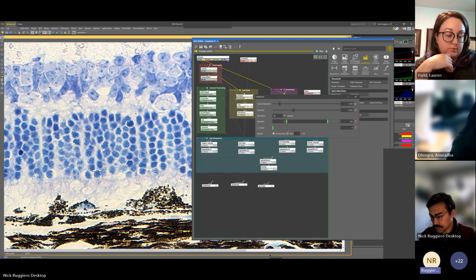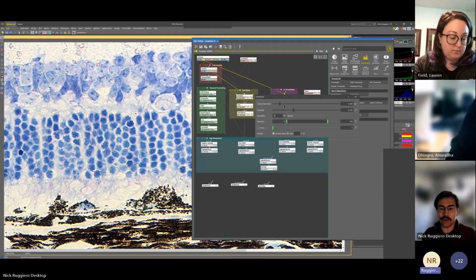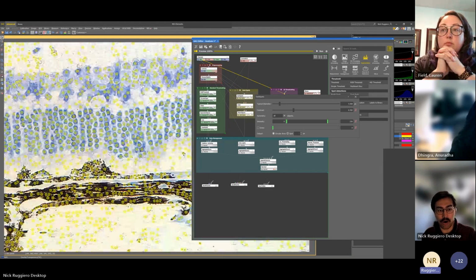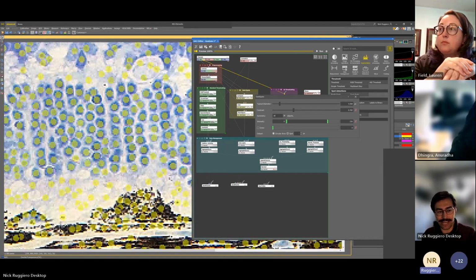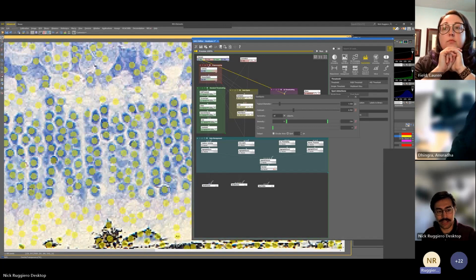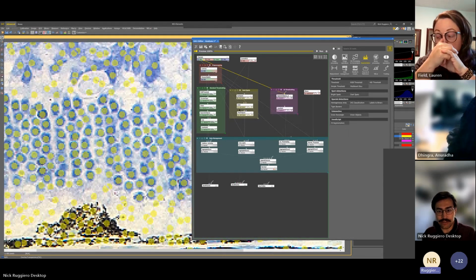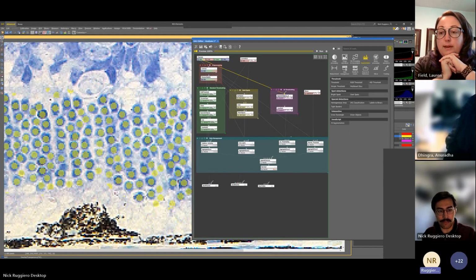What dark spots is going to do is, let me pull this up real quick. What dark spots is going to do is try and find any dark spot of some diameter, and we can tune those parameters here to get a little bit better idea. So if we see what that's doing, it's pulling a lot of points from all over my image. But when I went and looked at the region of interest, I thought that it was doing a really good job of picking up some of those spots that the standard thresholding missed. So I used my AND function again to try and get rid of some of those objects.